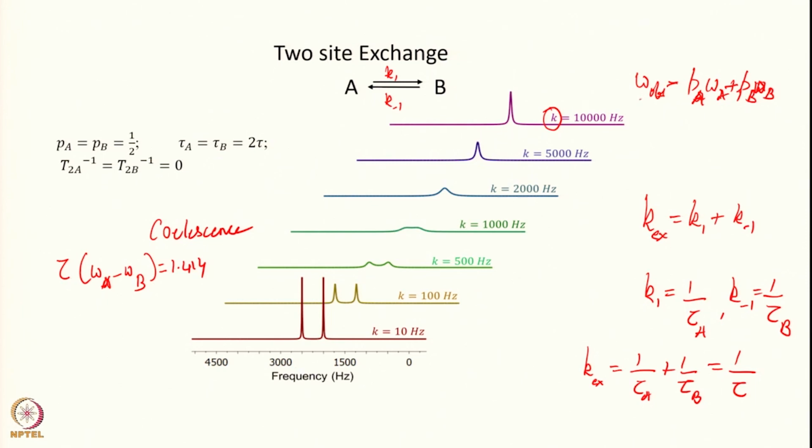This average will appear at the weighted average position when the exchange rate is far larger than the separation between those two.